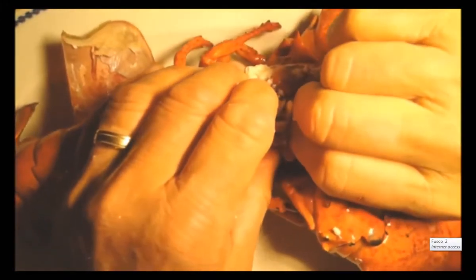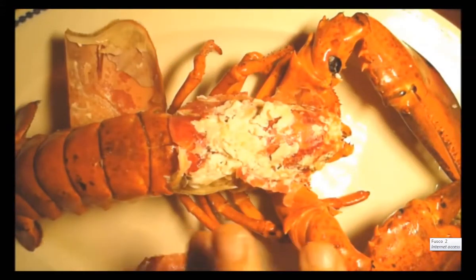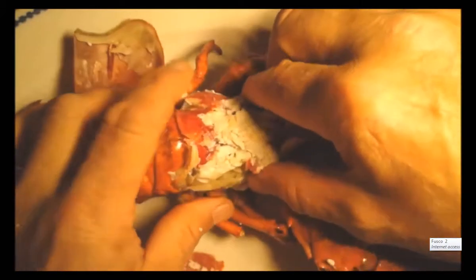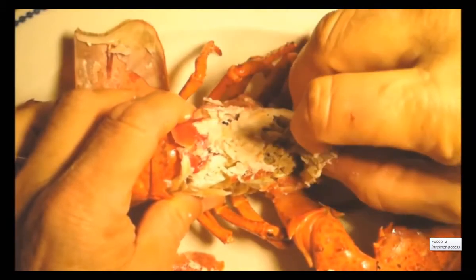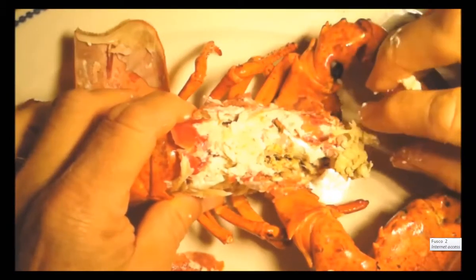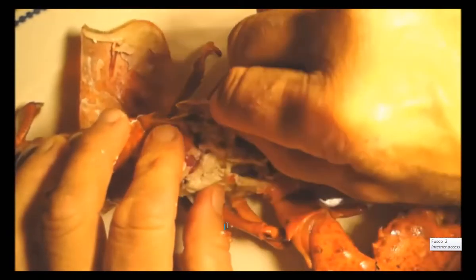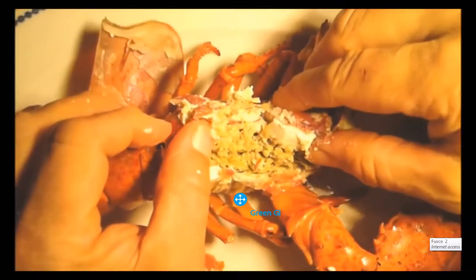I might have to do some cutting. Okay, maybe we won't have to do too much cutting. So, a couple of things — this green stuff is the digestive gland, actually the pancreas and liver of the lobster.